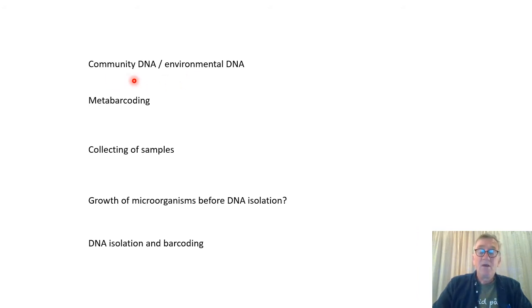Community DNA we often use if we collect a sample which consists of a mixture of DNA from various organisms, various individuals. Then we might call it community DNA, because it's collected from the same community, in the same sample, and the DNA present in the sample is often more or less the entire genome, or all the DNA from the organisms.